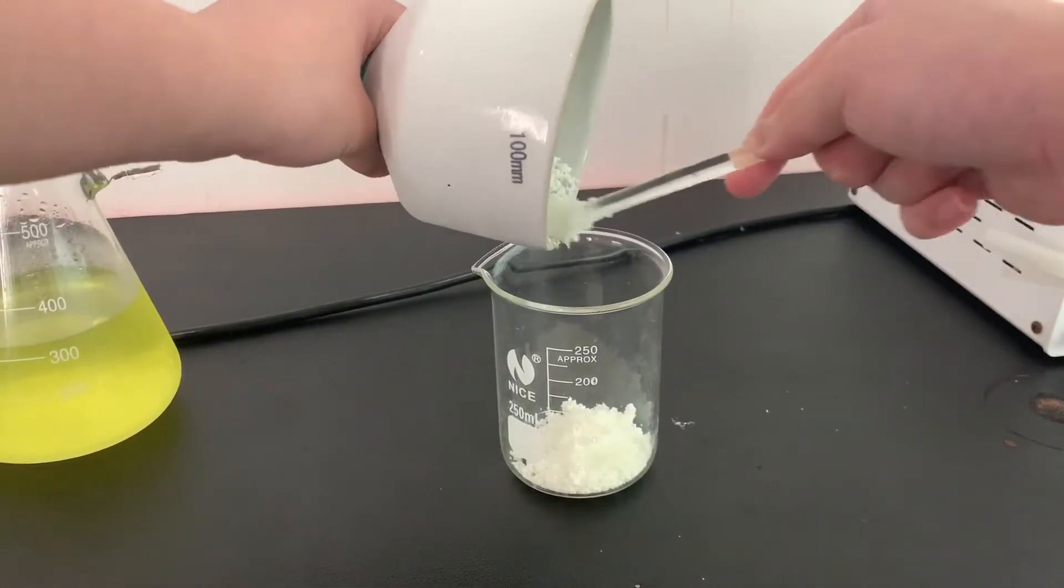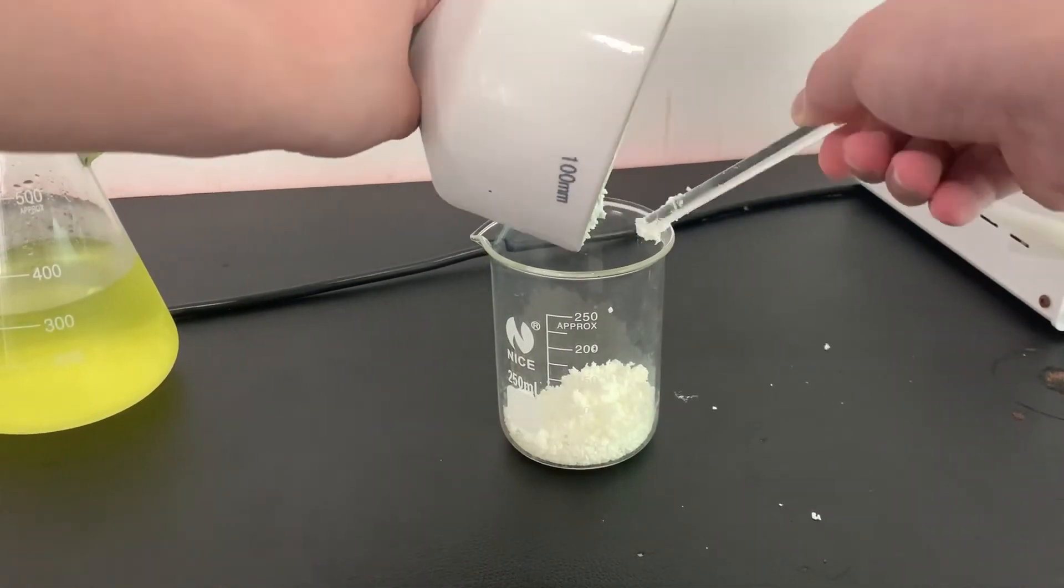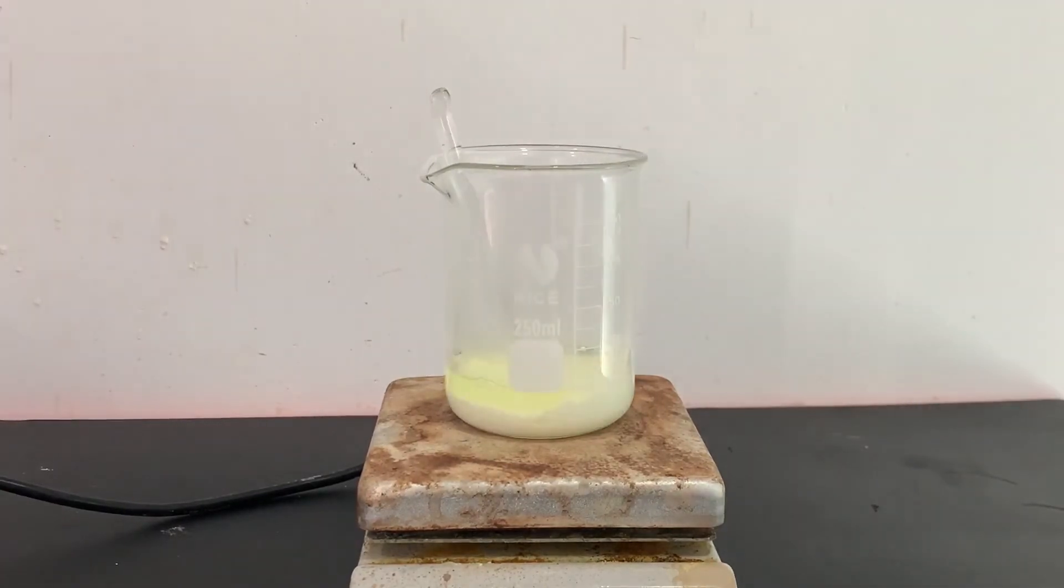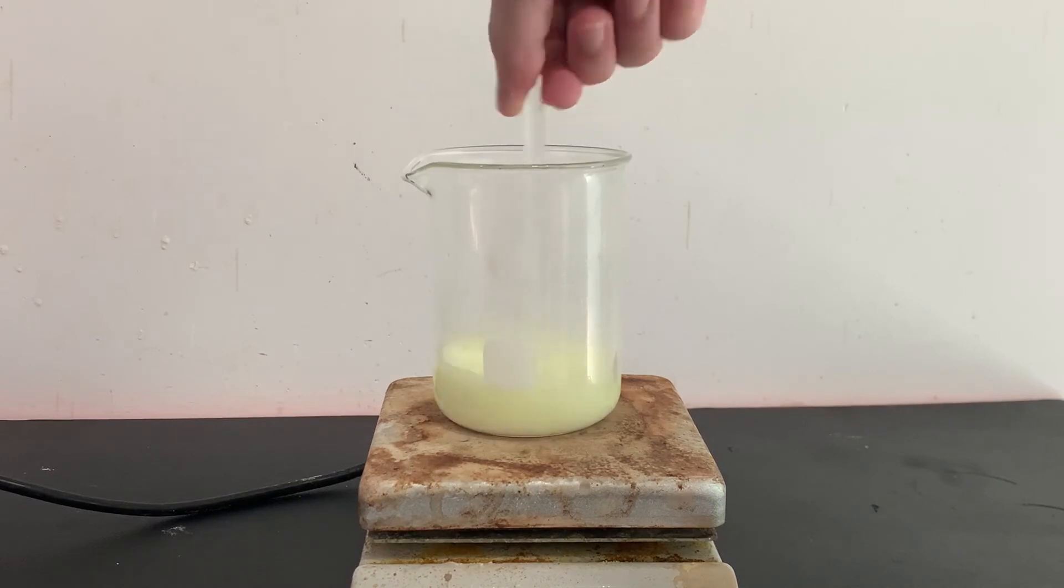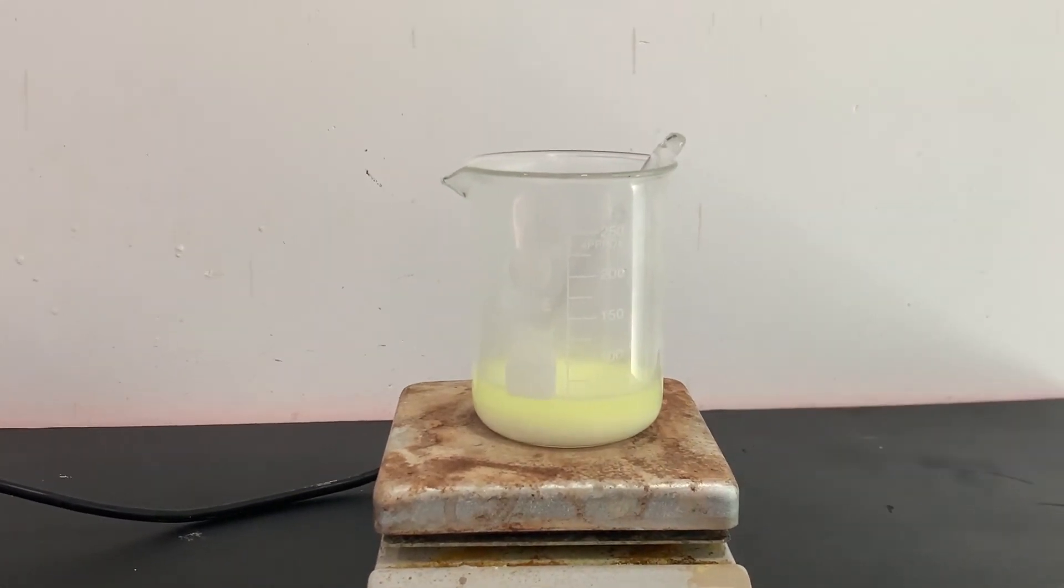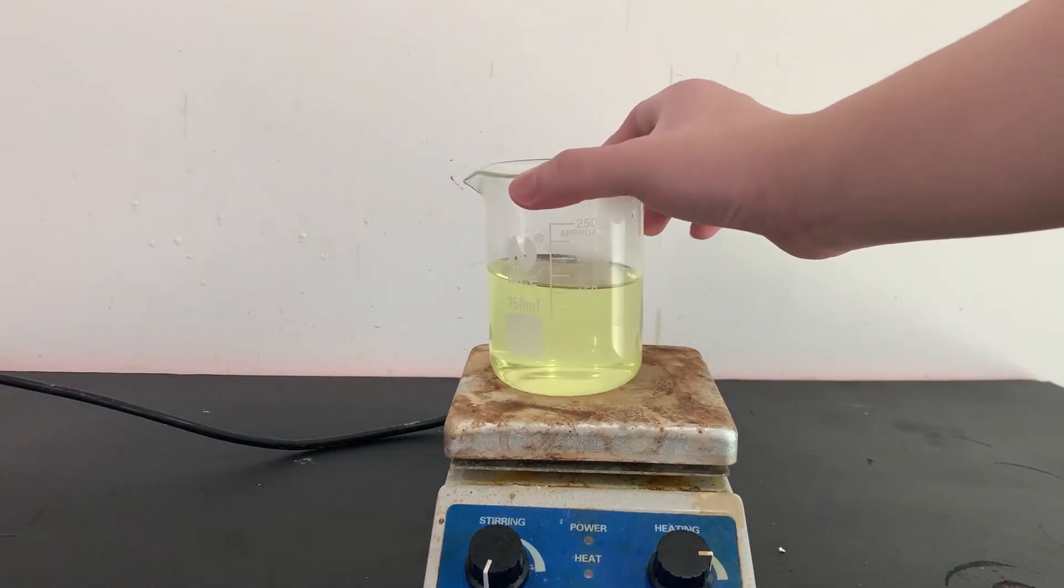The crude product is then transferred to a beaker to perform a recrystallization. Boiling water was then added to the crude 3-nitrophthalic acid until everything dissolves. Once everything dissolves, I'll cool the solution in the fridge overnight.